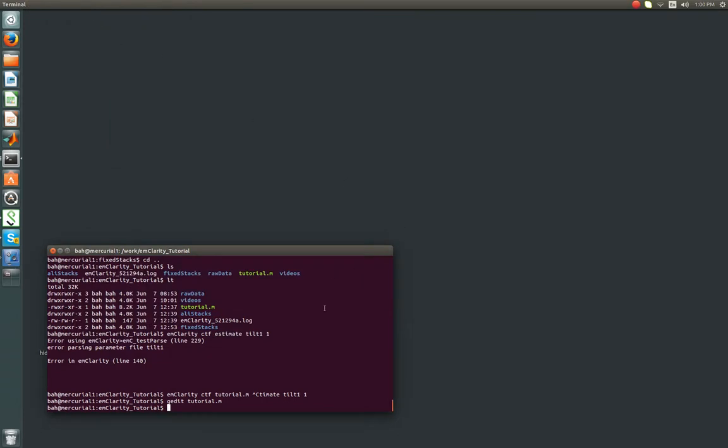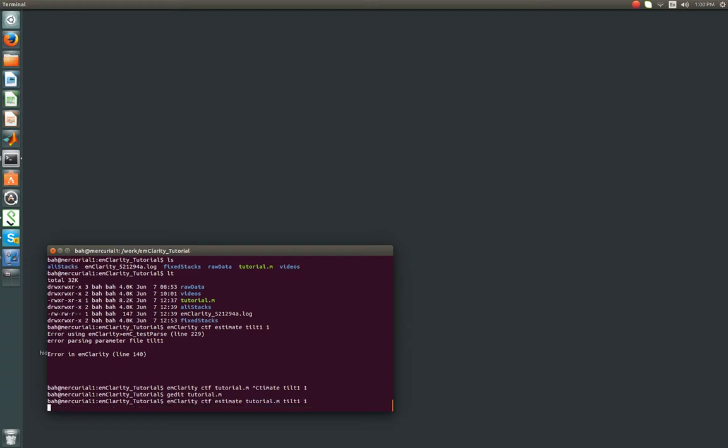So that's a brief overview of the tutorial parameters we're going to want to use, and now we'll run that again, except we'll go emClarity, CTF estimate, we'll include the name of the parameter file, tutorial.m, the prefix for the tilt series, and the GPU ID, and we'll check back in a few minutes.